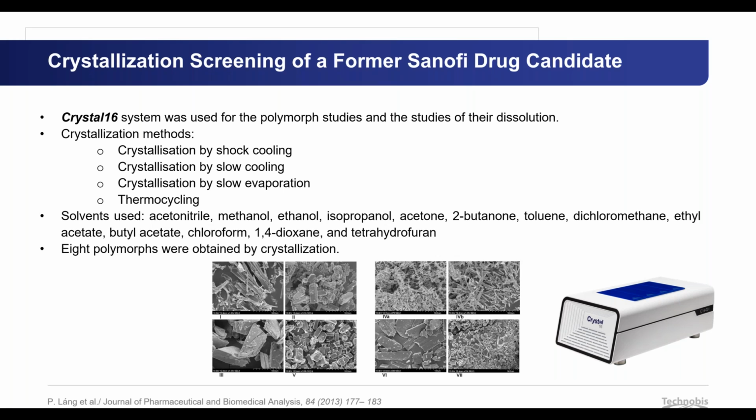They looked at chemical diversity in the solvents that they used, like acetonitrile, alcohols, ketones, and so on, and a few crystallization methods.